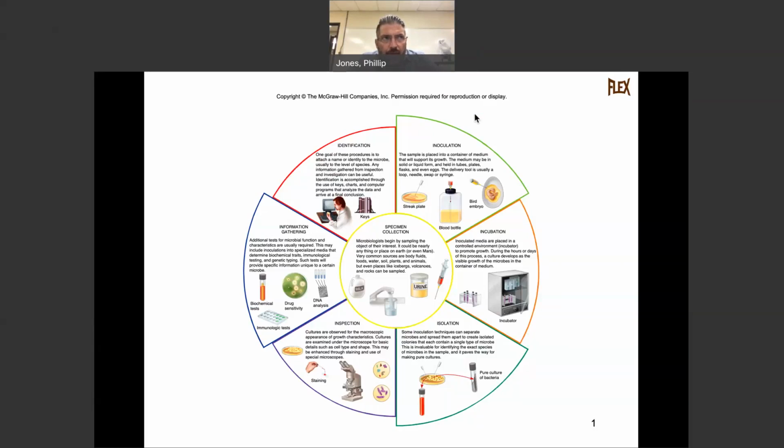We talked a little bit about the Sonicare. If you take the brush off, there's always stuff growing underneath where it attaches. Just get in your head where you would swab. Or if you had a wound or an infection, you could swab it. We would grow it, and then we do a gram stain, and we do some kind of selective culture on it to see what it might be, or what are some ways we can identify it.